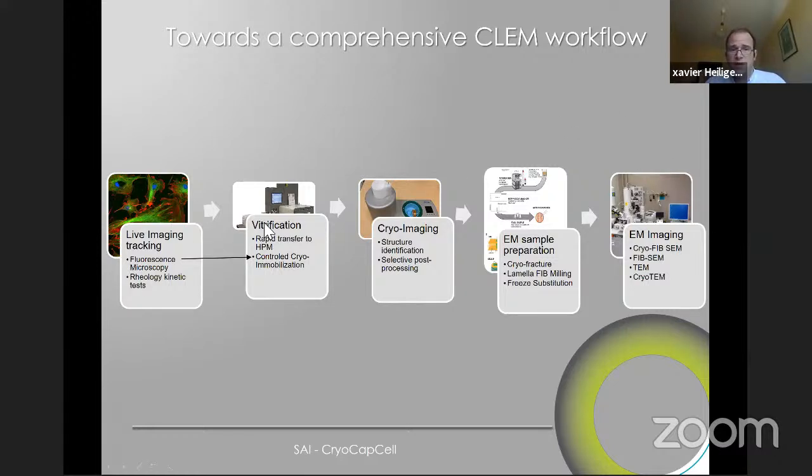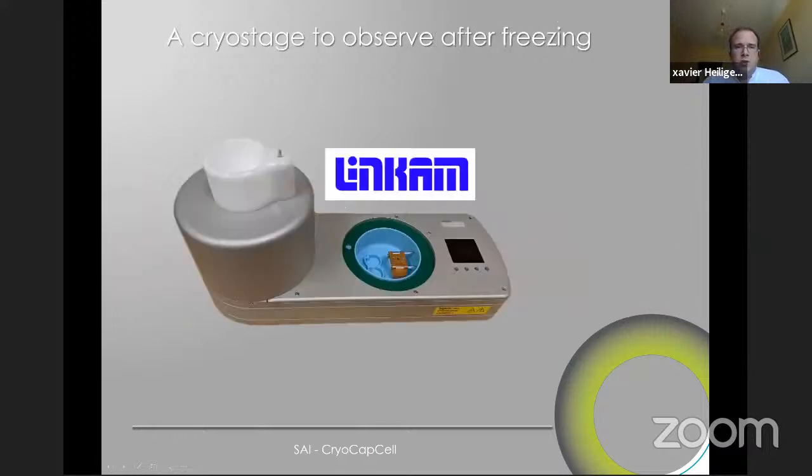So the first one is easy. Then you do high pressure freezing, and then you can do cryo imaging. And you could do some imaging here. Again, that's what I said in the introduction, before doing the EM analysis. So let's focus on the Linkam stage or any cryo stages. To date, those cryo stages are commercially available from Leica or Linkam. And as you can see here, they require the use of upright microscopes.